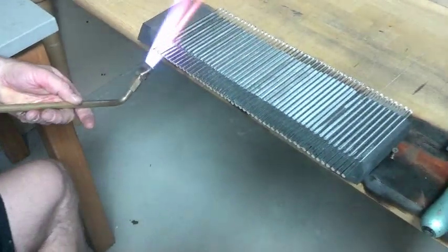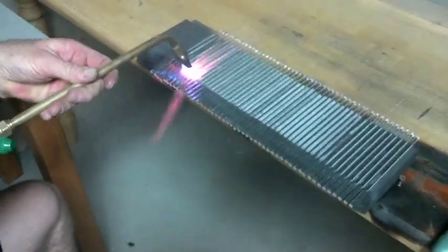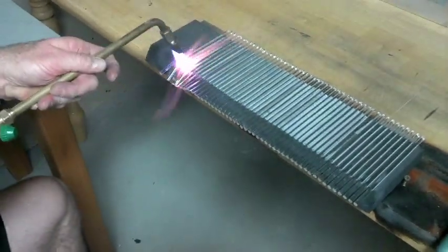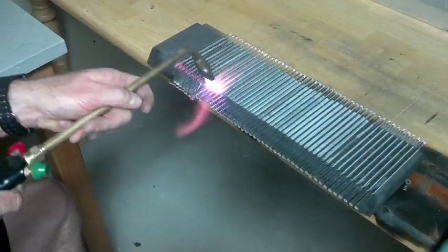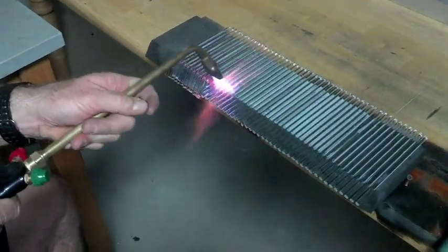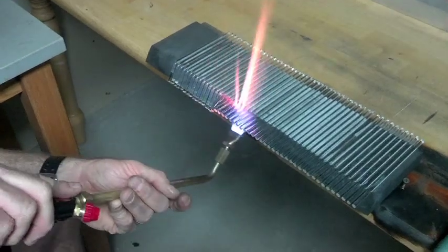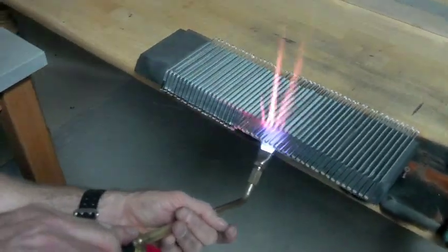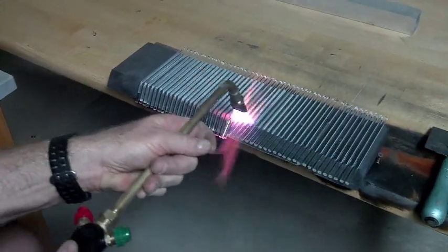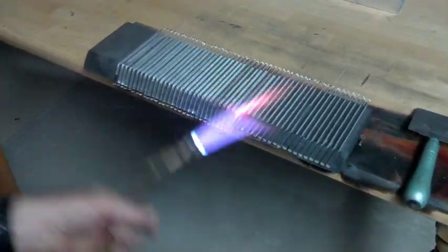I'm going to do the bend. Fire polish to the back side.